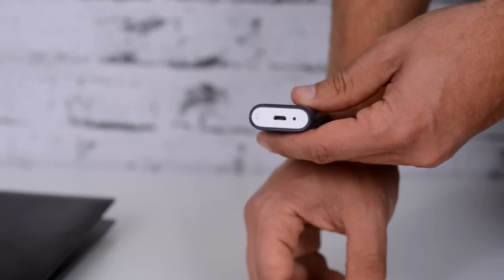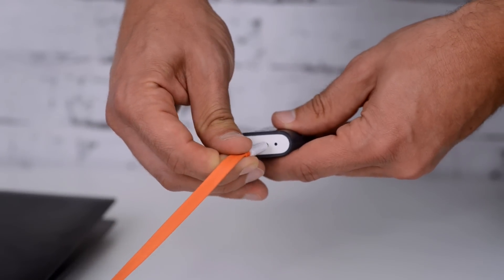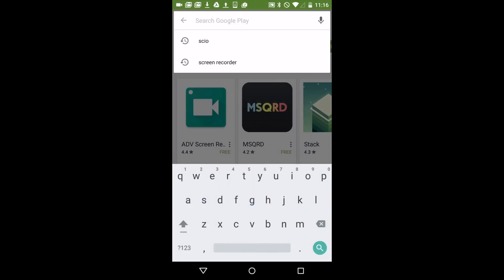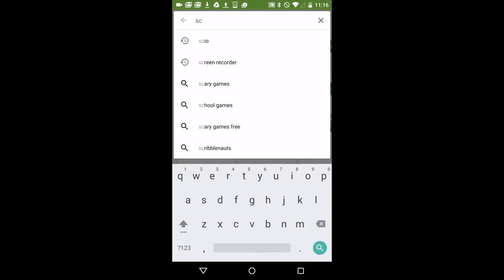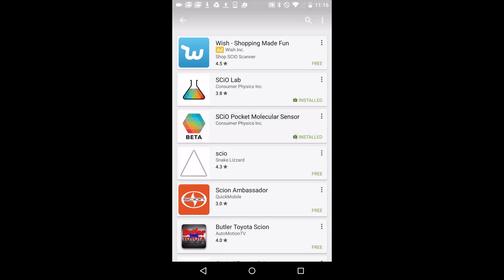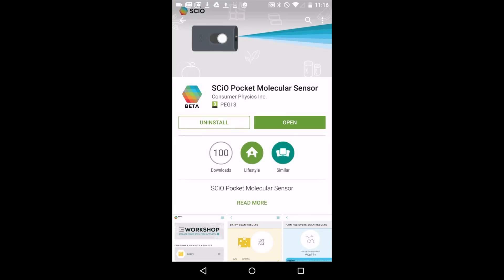Before using SCiO, make sure that you charge it for a couple of hours until the LED light turns green. Also make sure to download the SCiO app from the iTunes App Store or Google Play — just search for SCiO. Please know that SCiO Lab is for developers and requires a separate license.